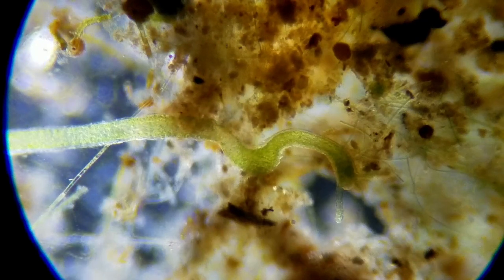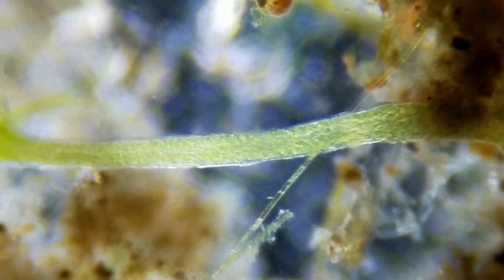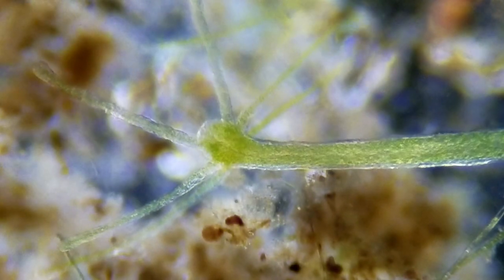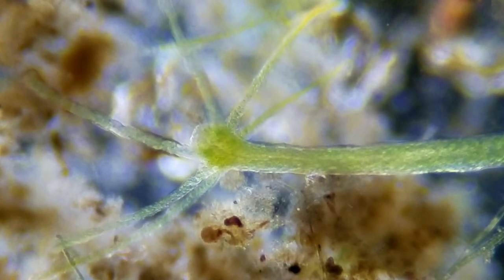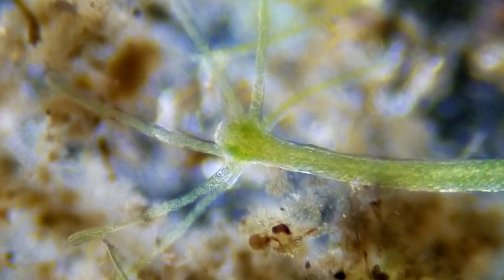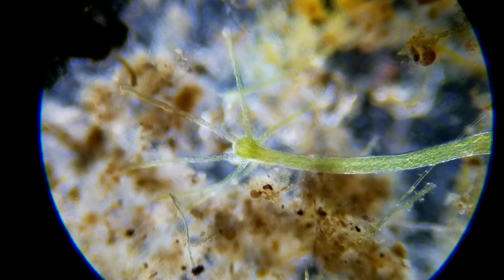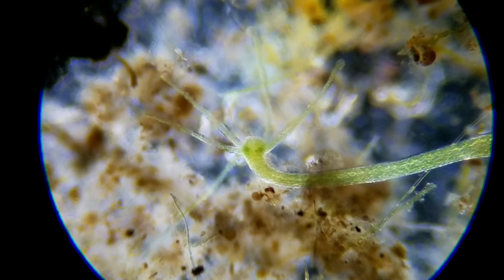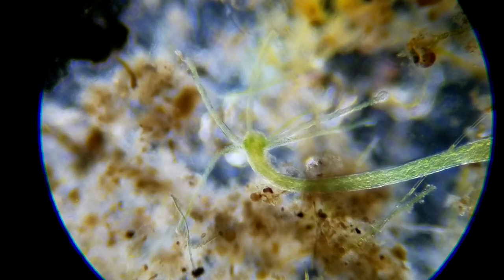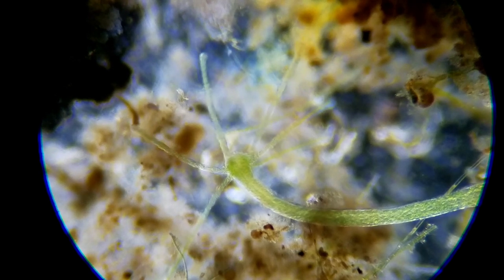This is one of my favorite creatures of the microcosmos. Look how long he is — green. They're fairly common and this is from pond water. Look at the head here — this is called the hydra. And I think he has six tentacles on him. The hydra comes from Greek mythology, of a six-headed serpentine creature. If you cut off that creature's head it would regrow two heads instead of one according to some mythologies. So it had regenerative power, and that's probably why they call this the hydra — because it has amazing ability to regenerate. Scientists have studied the hydra and they cannot tell how old the hydra is; it does not show any aging, and some have even called it immortal.